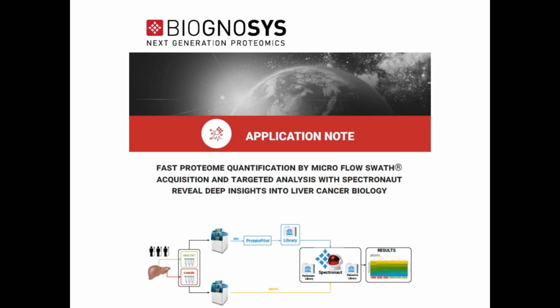The next question for you, Nick, is about the LC, and can it be shortened to something like 30 minutes? You can. We have done this. You do start to lower the number of proteins you will quantify, because as you make the gradient shorter, your peaks get sharper. With the duty cycle for the SWATH at around 2 seconds, the number of points across the peak is quite important. With a half an hour run in microflow, you might have peak widths at base of maybe 10 seconds or less. So you can, but you may need to adapt your SWATH method.